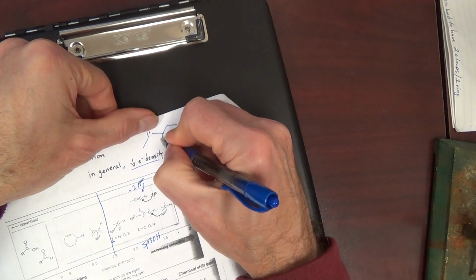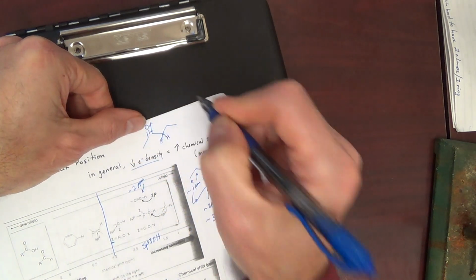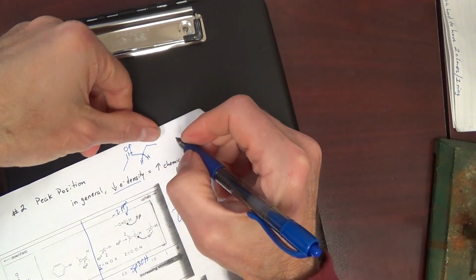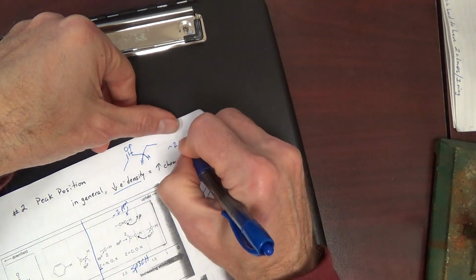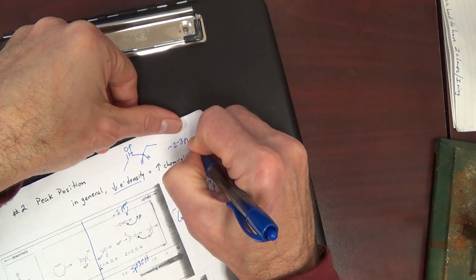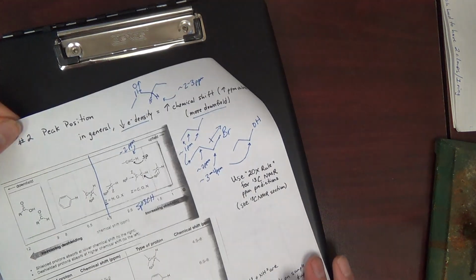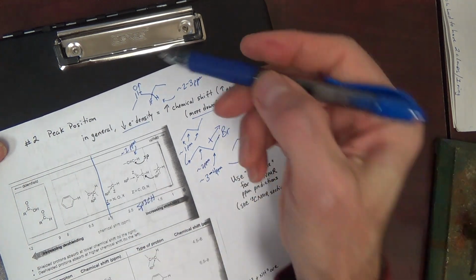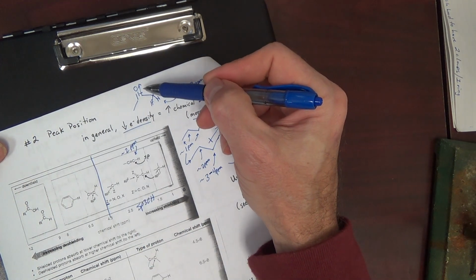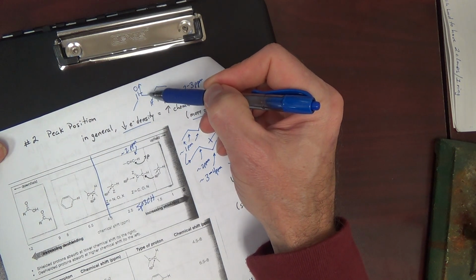But these H's over here, next to this electron withdrawing group, are going to be about 2, I'll broaden it out a little bit, 2 to 3 ppm. Most common is a carbonyl, or this could be a nitrogen group.